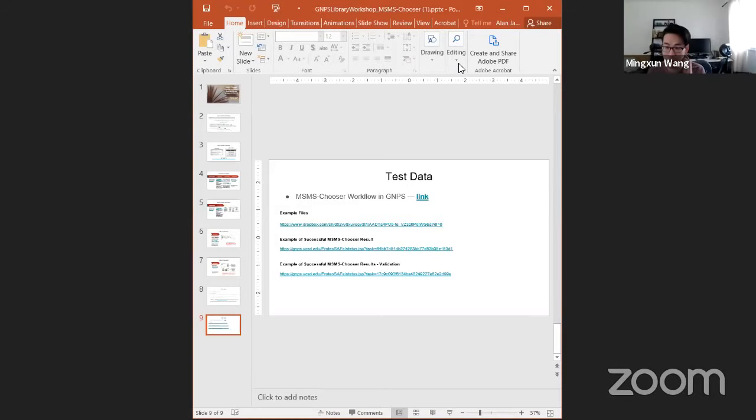Just to clarify, especially if you don't use the flow injection method on your own, if you already have data where you ran several standards or one standard per run, there's a template that you can fill out that fills out all this extra stuff for the Orbitrap that Alan showed. But there's one specific thing that it generates automatically, which is an input to MSMS Chooser. Essentially, it says this LCMS run has this structure in it. That's the meat of it. If you fill that out either using our template or you create that manually, it will work.